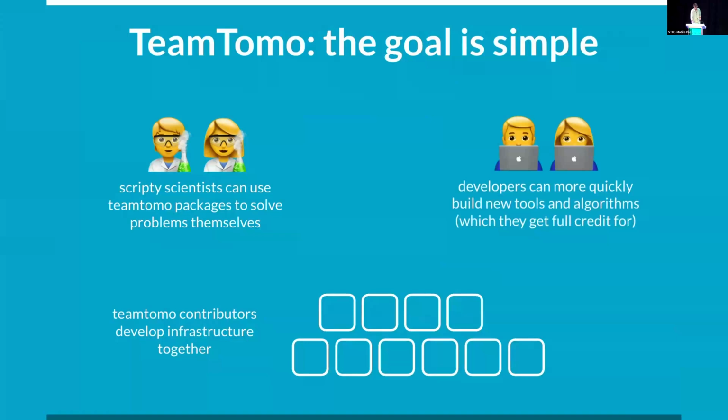And then anyone who wants to develop cryo-EM software, at the minute, you kind of have to reinvent the entire world. The world is really big. There's lots of stuff that's already been done. I'd like it if it was easier to take out of the toolbox the things that are already solved, and then just build your little piece that's new and exciting. And then maybe if these developers are good-willed, they contribute something back to this ecosystem, and then we have another brick, and we can continue to build together.